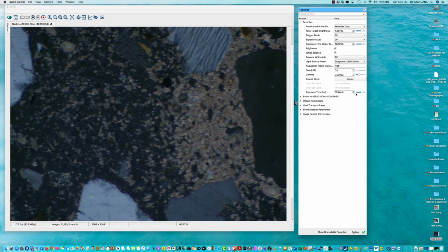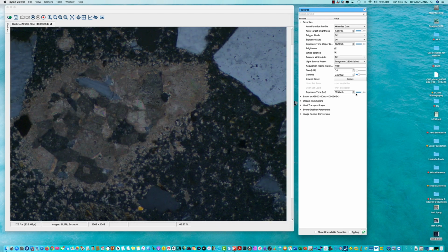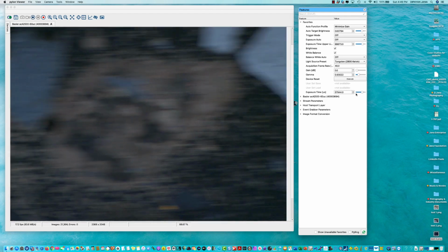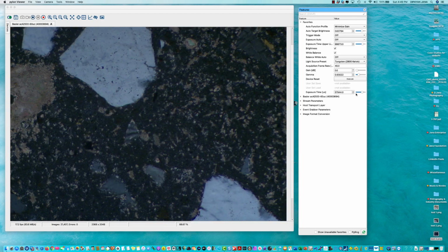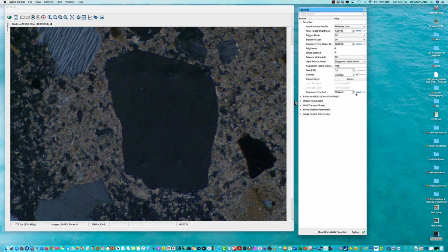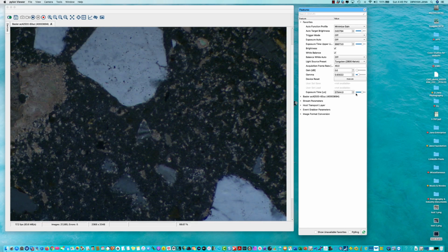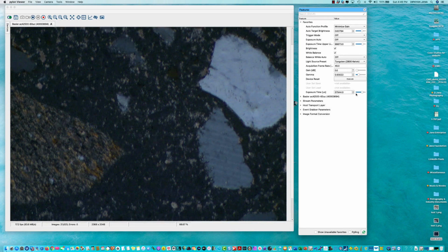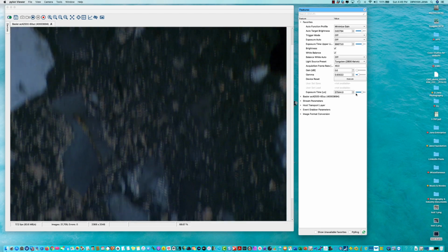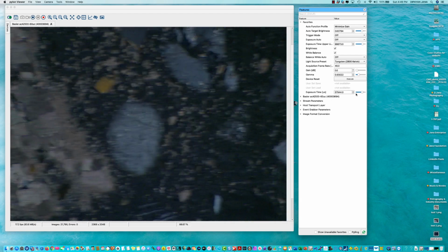So when we do the fluorescent dye mixed epoxy, we get an area where the cracks are visible. We take an image in the plane polar, then cross polar, then we close the transmitted light base by putting a barrier on the top, then open the shutter for the reflected light attachment, bring the filter cube and capture an image in the fluorescent light mode. That's how the same particular feature can be seen in plane polarized, cross polarized and fluorescent light mode.